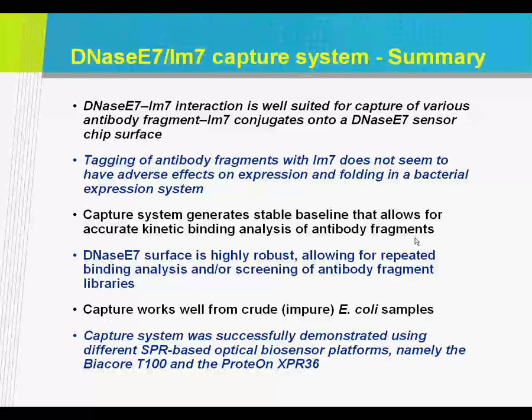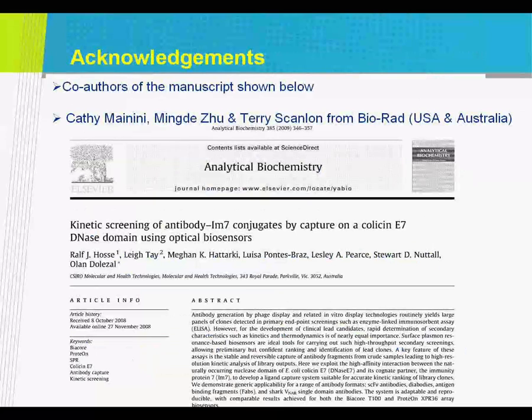The reasons could be just the way you're setting up your method, or sometimes you need to do an experimental design, that is, experiment with your protein concentration or how long you inject for. I have found that some of these optimizations can be a long process.